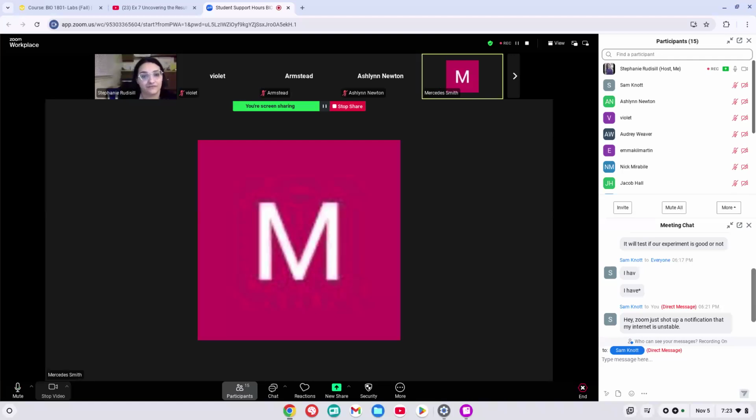For the DLN, it says we need a picture. What should we do for that? You probably are going to want to... I'll have to actually upload it to the learning platform so that you guys can work through that, but it would be the one, that per 3-4. Yeah. Okay. So you just want to make a figure out of it. And remember, you're going to want to label the ladder, the negative controls, positive controls, and the experimental samples at the top, and put that title down at the bottom.